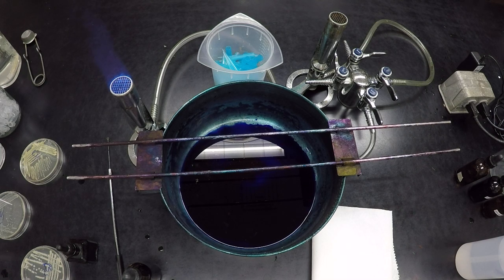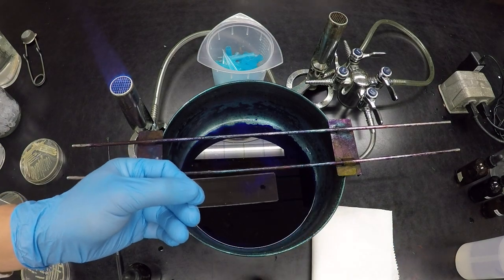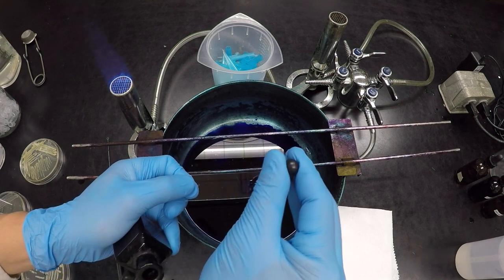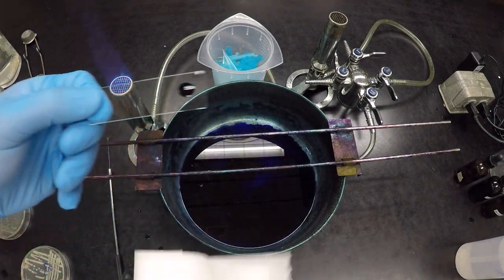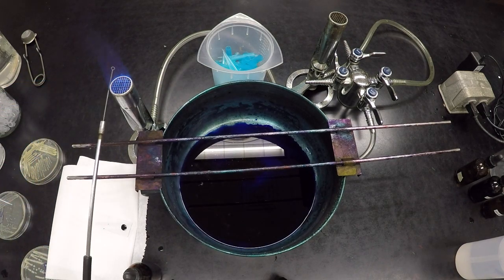Alright, in order to do that, we need to color the background. And we can only put one bacteria per slide, right? So we can't mix. So what we do is we take our nigrosin. I need to get a bunch more nigrosin. There we go. And we place it in a drop just like that, okay? So I'm going to leave that here so you guys can see. And then we need to take our bacteria.